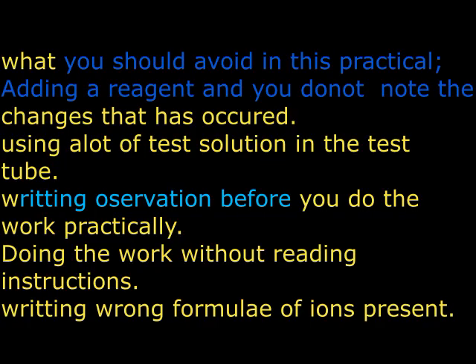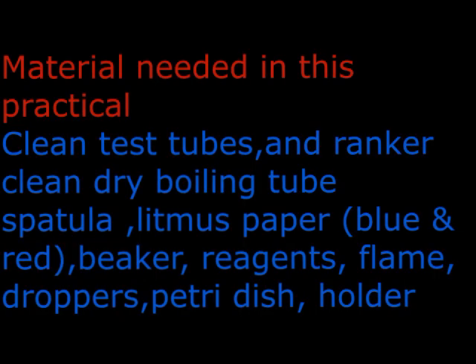So our practical investigation is going to be on a certain non-colored cation, which we are going to discover together, and an anion, of which salt it is. So we are looking at a non-colored cation. Now, this one is going to give us the name of the salt which we are investigating.